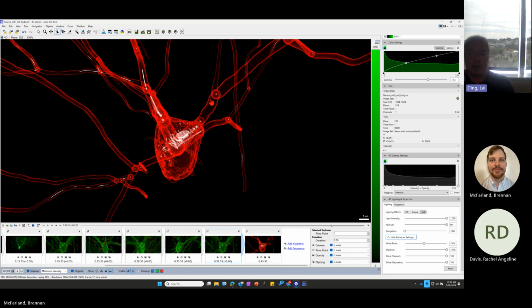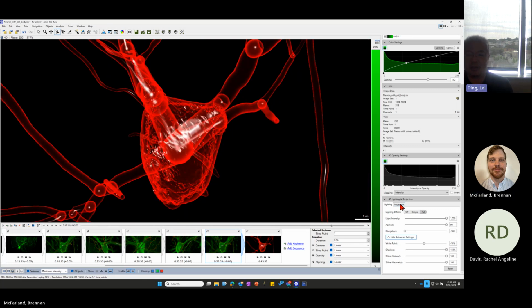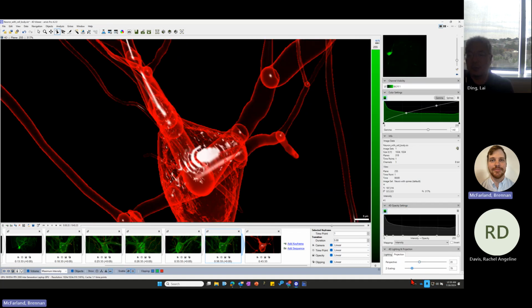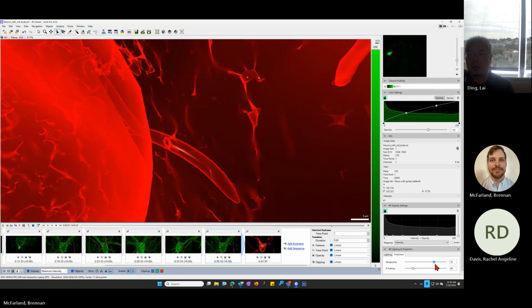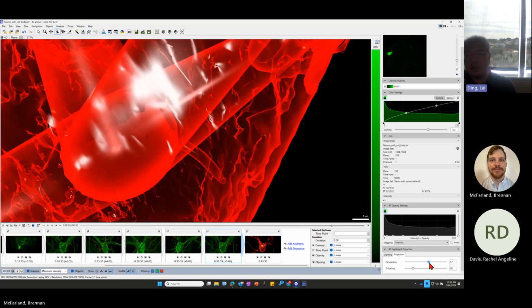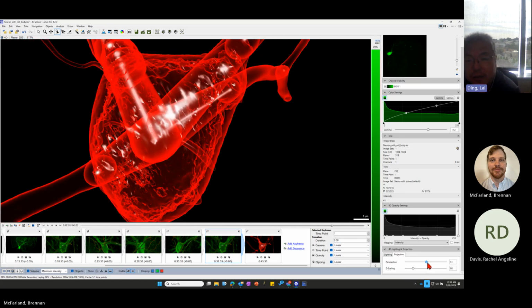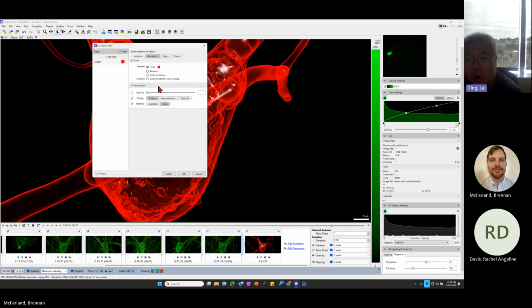But can we fly the point of view to be inside the cell body? It's like a ball. If this is a ball, can we go through the surface and fly into it? Yeah. Let me, where is that? I think that's Z. Or maybe perspective. One sec. Let me find where. Yeah, there we go. Can we make it not transparent? I just want to see if it's all opaque, but I can still fly into it. Then we can see the inside wall.